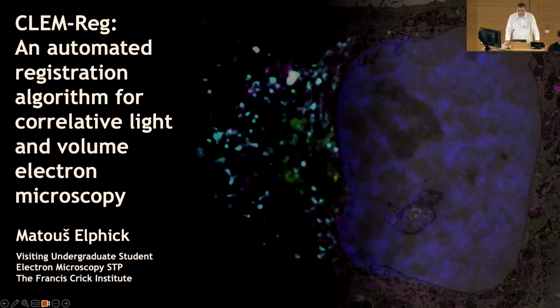Cool. Hello, everyone. My name is Matouš Elphick. I'm an undergraduate student studying computer science at Newcastle University. And today I'll be talking about some work that I helped with during my industrial placement last year at the Francis Crick Institute in the electron microscopy science technology platform. And that work is CLEM-Reg, an automated registration algorithm for correlative light and volume electron microscopy.